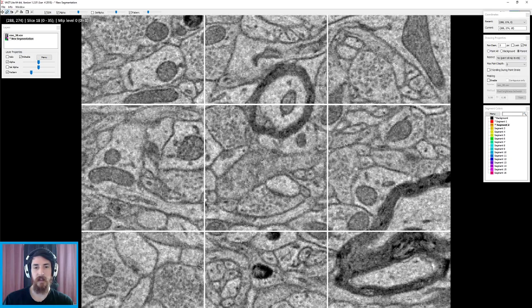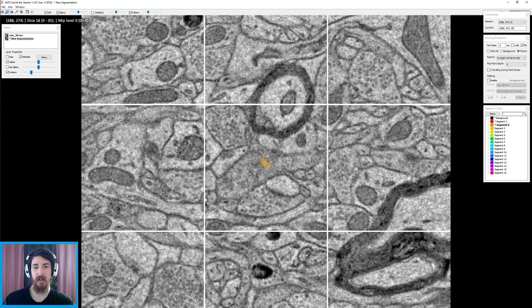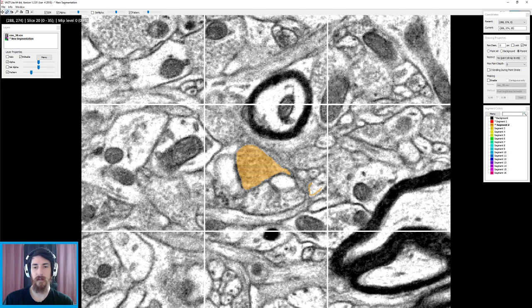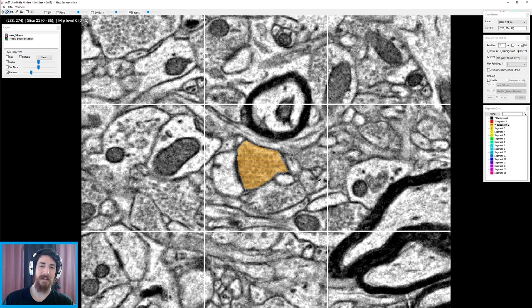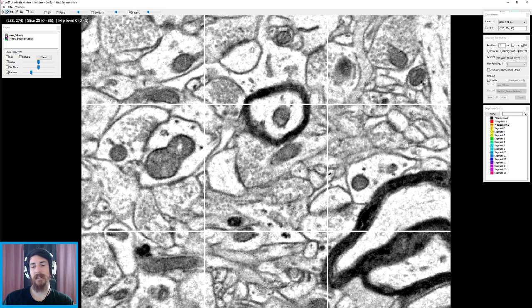But is this me? I think that's me right here. Is this me? Alright, and this little guy's going off over here, so we have to be sure to get that. We saw in the Neuroglancer link that that was a bouton. So this is just a little flower petal poking out off the main stem, trying to absorb that sunlight. That neurotransmitter sunlight. What am I saying? I better speed this part up. Okay. Let's get that. It'll look really cool sped up, I think.